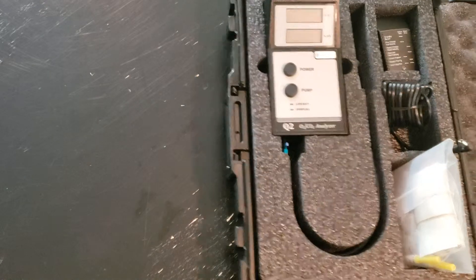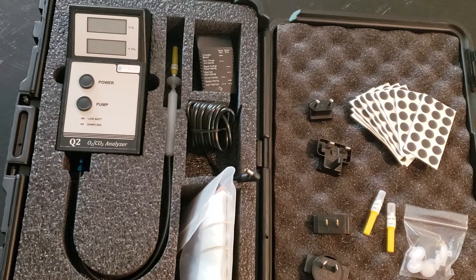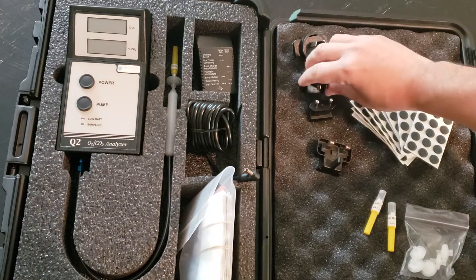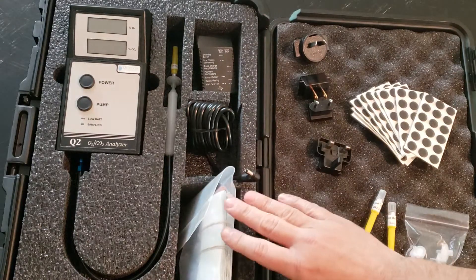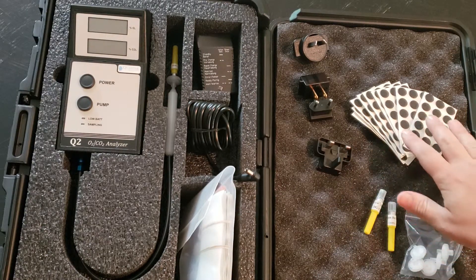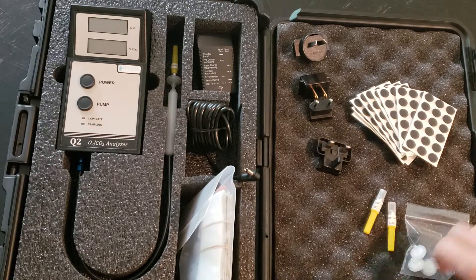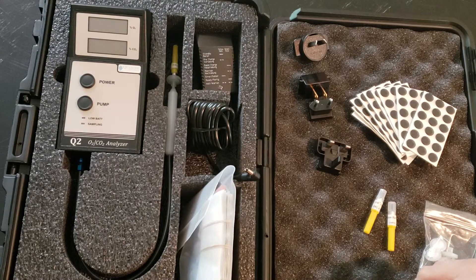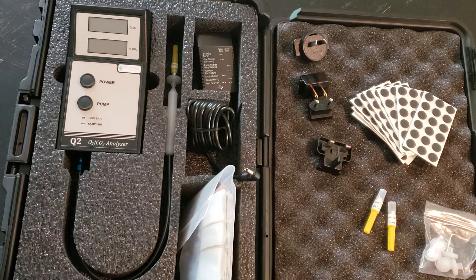The instrument comes in a hard carry case and features all of the international plugs that you might need depending on your power system, a charger, and a set of consumable items. Those are separated out so you can see the foam septa, needles, and filters. Filters are very important — they will block liquid and particulates from entering the package.